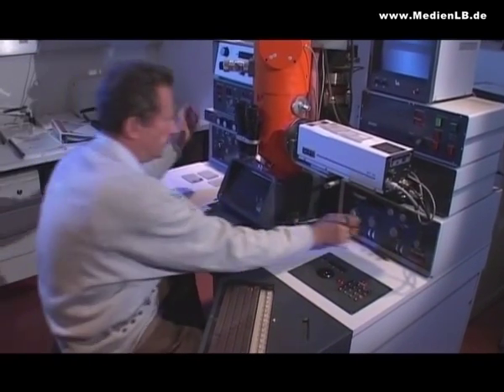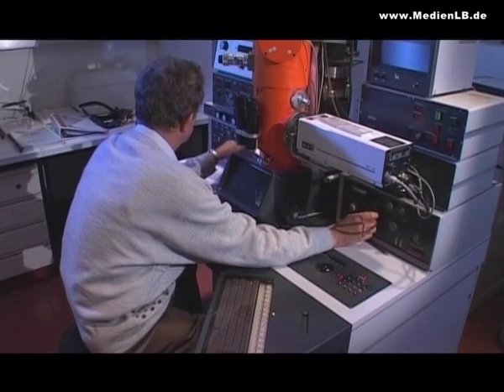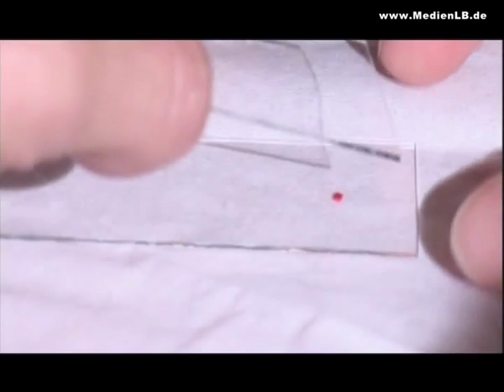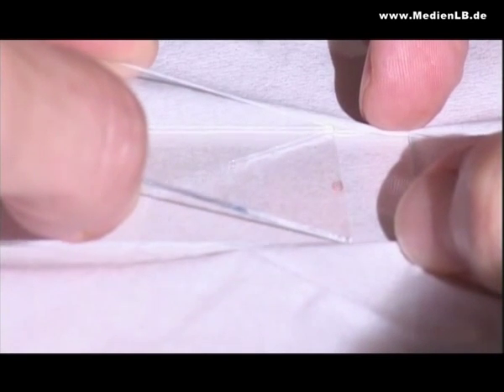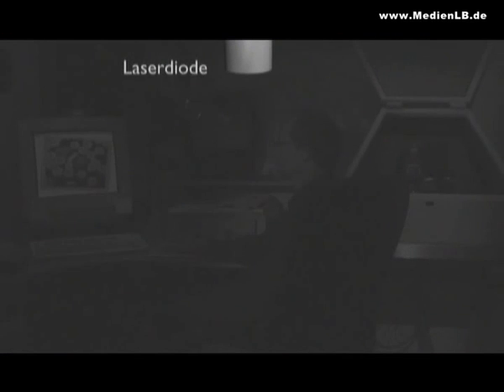The atomic force microscope, also called scanning force microscope, is able to provide three-dimensional pictures in the nanometer range, that is at millionths of millimeters. With the help of this technology, we can render the red blood cells in this drop of human blood three-dimensionally visible, like in our example.